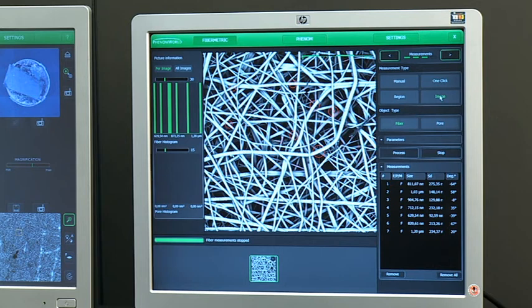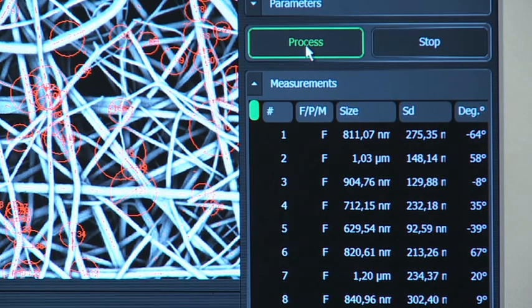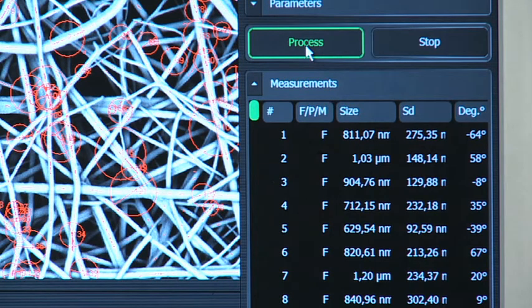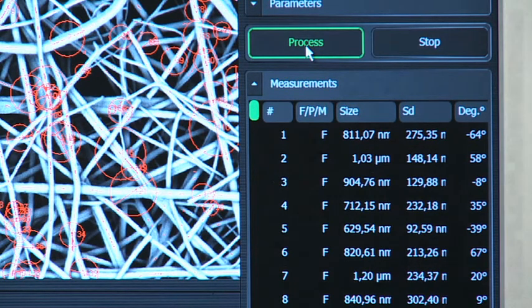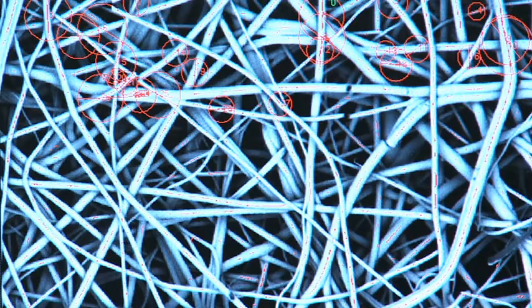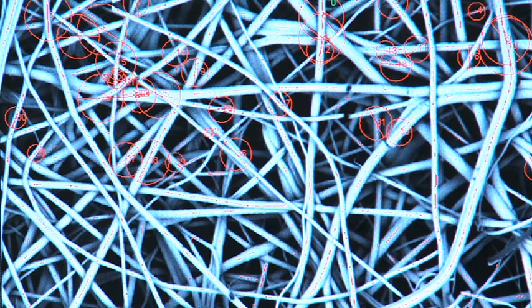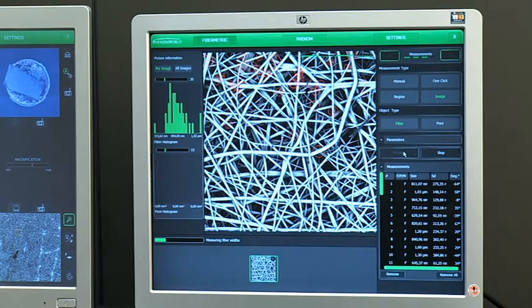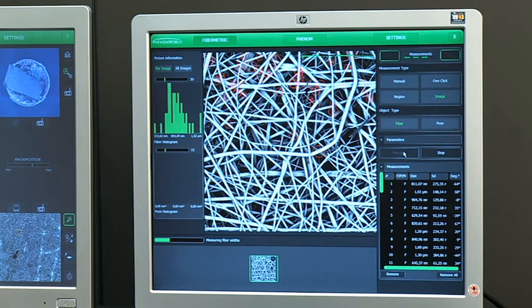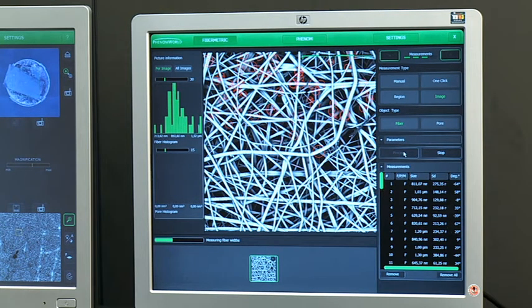The fully automated procedure can be started by selecting image and process. Once processing starts, FiberMetric collects all data automatically using the settings specified in the parameters menu. While fiber and pore data are being collected and stored, a histogram is filled visualizing the fiber size distribution.